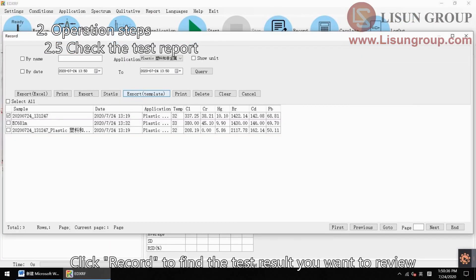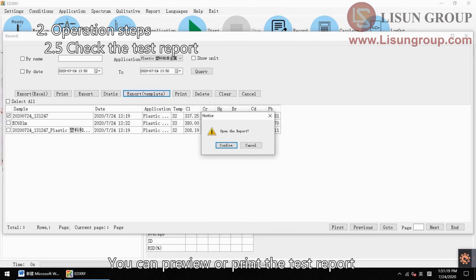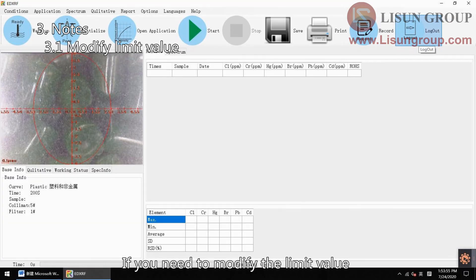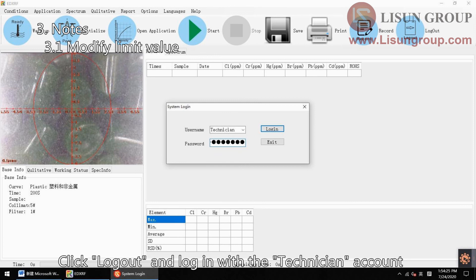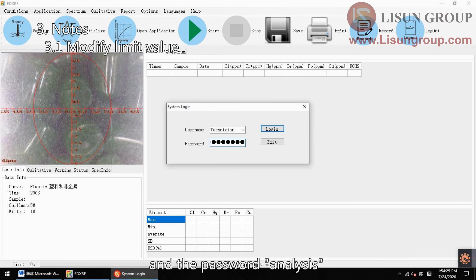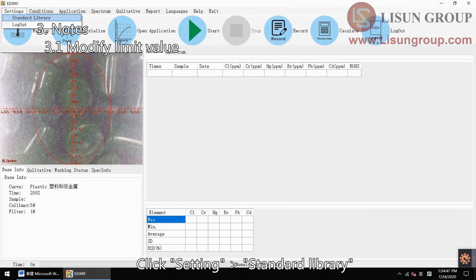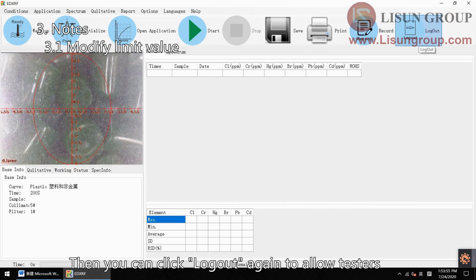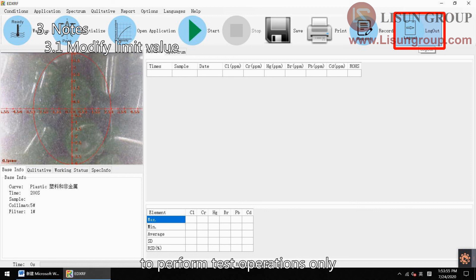Click record to find the test result you want to review. You can preview or print the test report. If you need to modify the limit value, click log out and log in with the technician account and the password 'analysis'. Click setting, then standard library. You can modify and save the limit value here. Then you can click log out again to allow testers to perform test operations only.